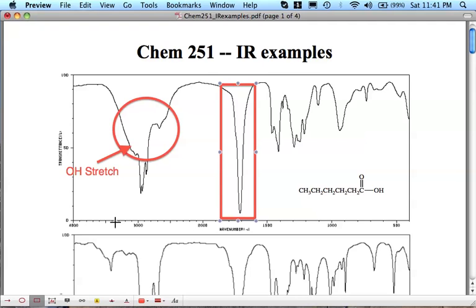In your book, the scale is continuous throughout. That is, it's the same distance between 1,000 and 2,000 as between 2,000 and 3,000. So that's a little bit something different in these two spectra. So sometimes you need to get the exact wave number or something a little closer.